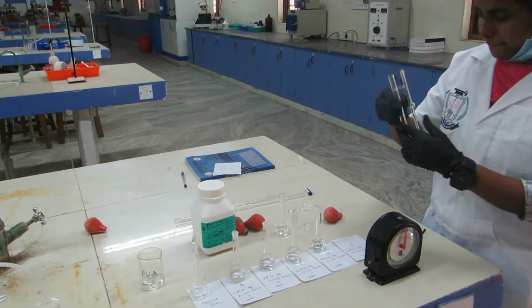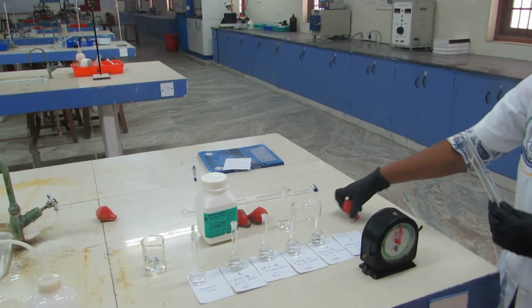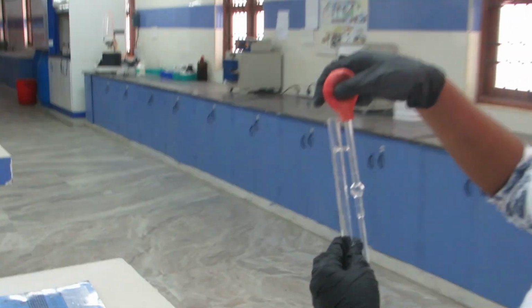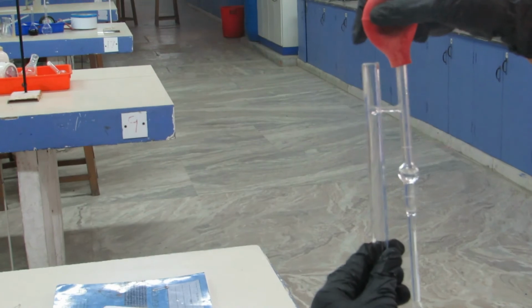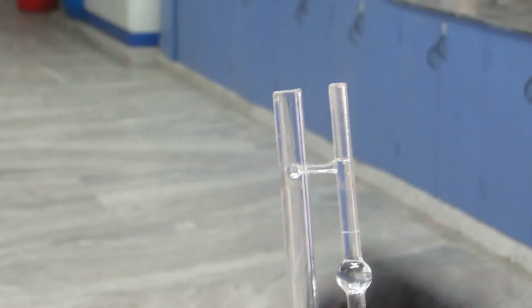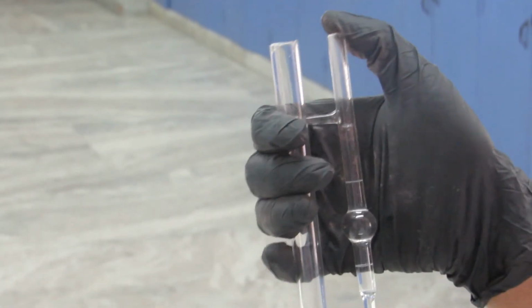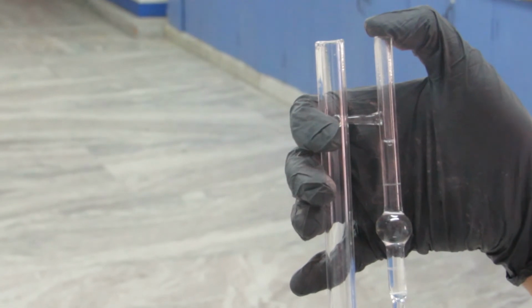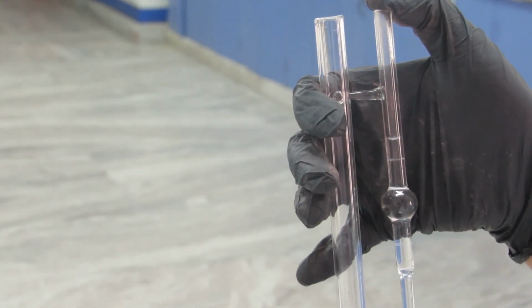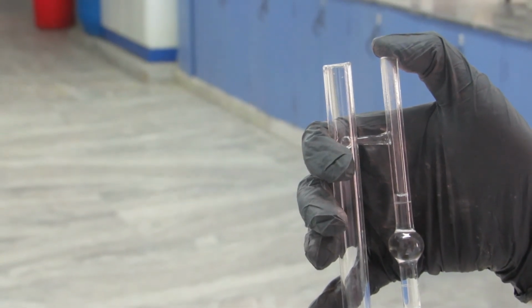Same thing, we are taking the rubber bulb and sucking the polyvinyl alcohol to the right side, and exactly once the PVA reaches the mark, we have to close it. Okay, now we closed it, yes. Go to the stopwatch at a time, and you release the stopwatch as well as your finger.